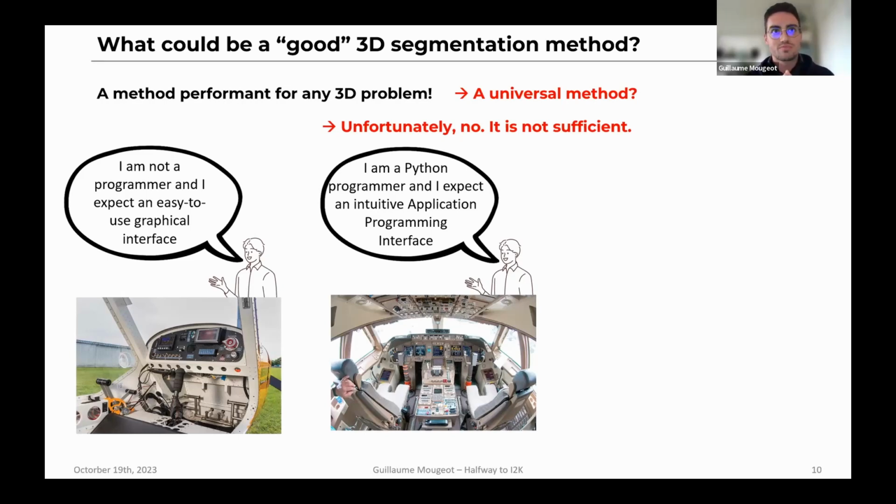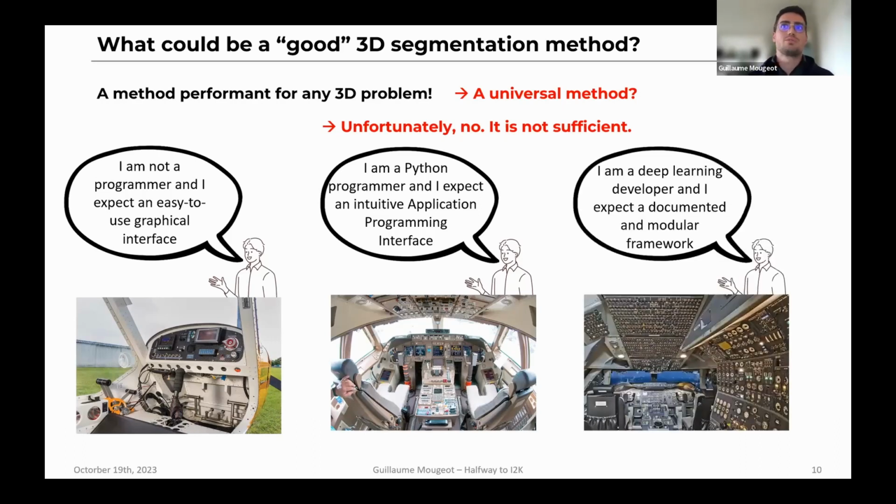And so without any need of complex configuration, but they still want to be able to access some fine parameterization.